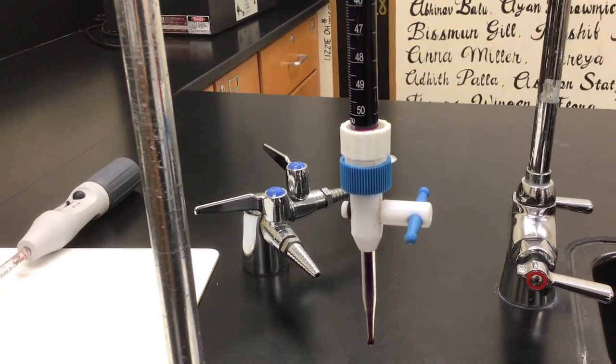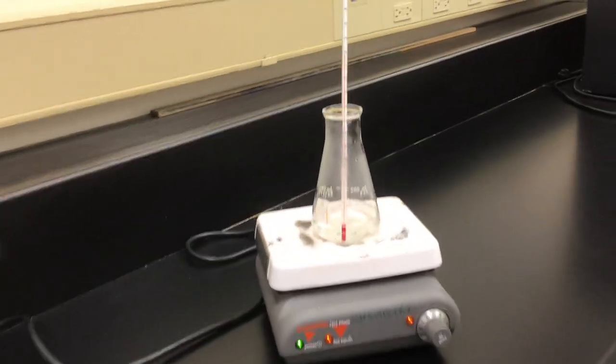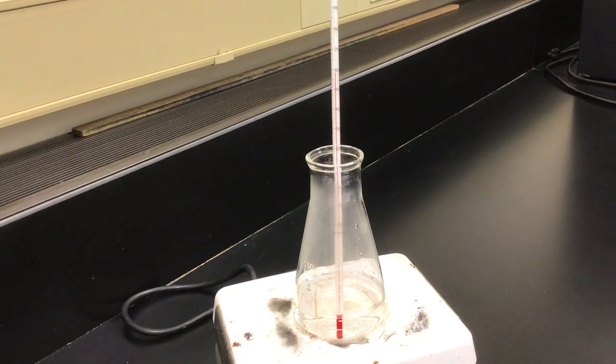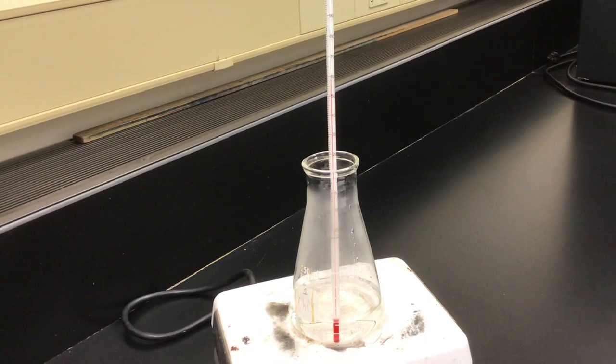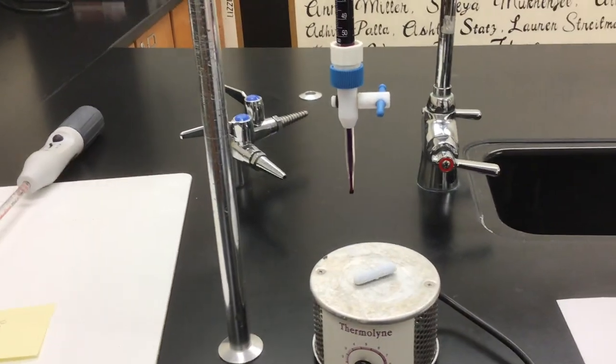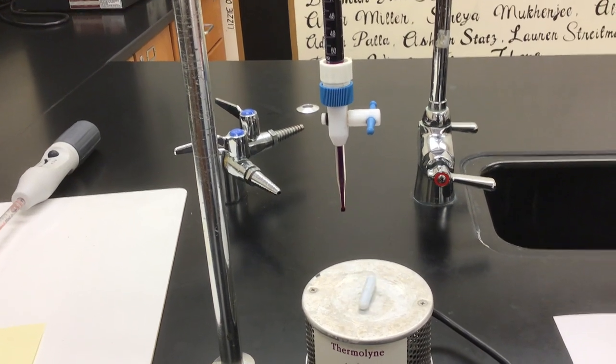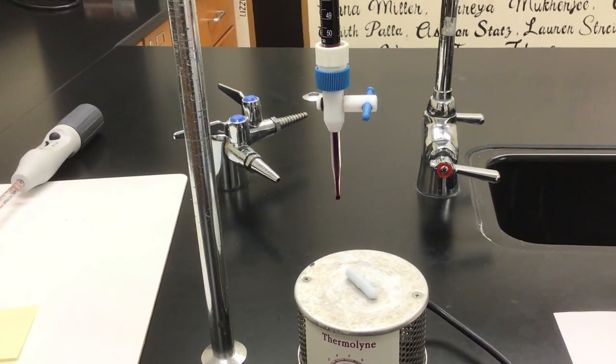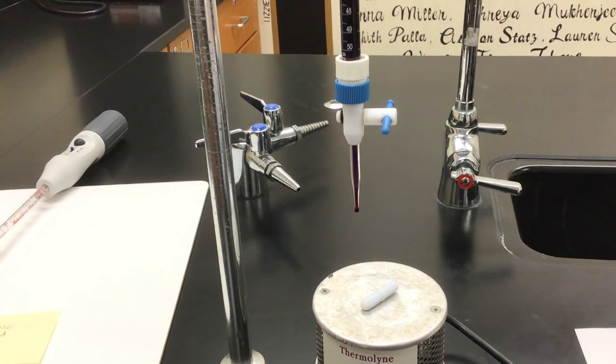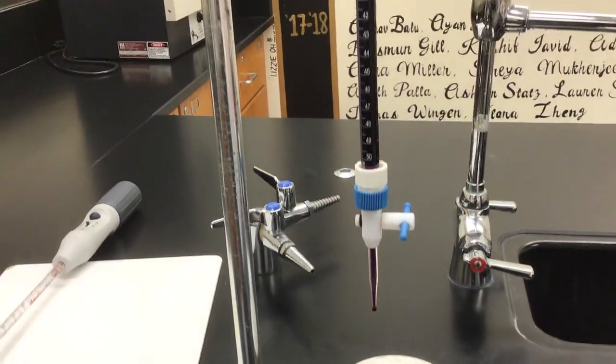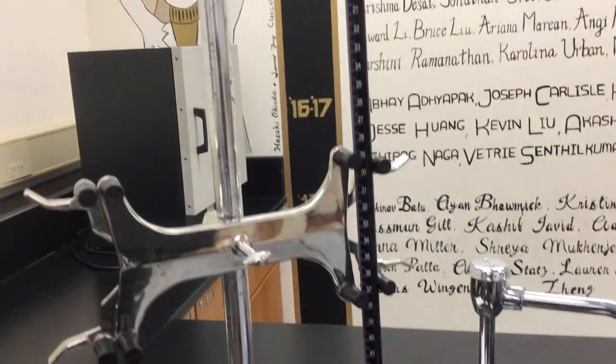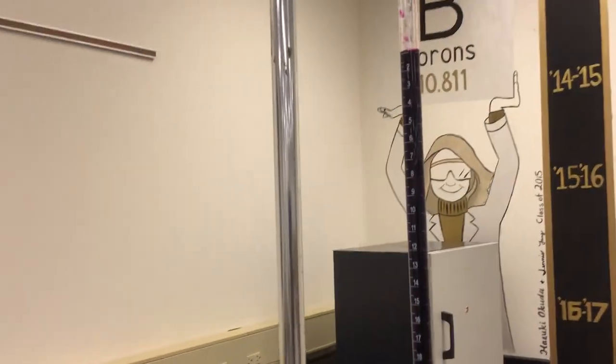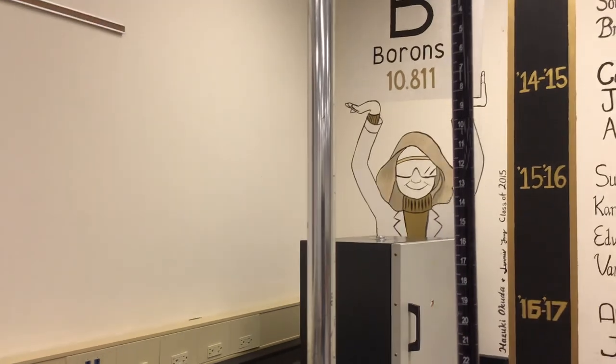So in just a second, we're going to put our oxalic acid solution, which is warming. It's at 60 degrees. We're trying to get it to about 85. We're going to put that guy underneath here, and that auto stirrer is going to go in that oxalic acid. And we are going to titrate our oxalic acid with our potassium permanganate solution until we see a faint pink color. Our goal is to figure out the exact molarity of this potassium permanganate solution. We know that it is somewhere around 0.02, but we're going to figure out exactly what it is after our titration.